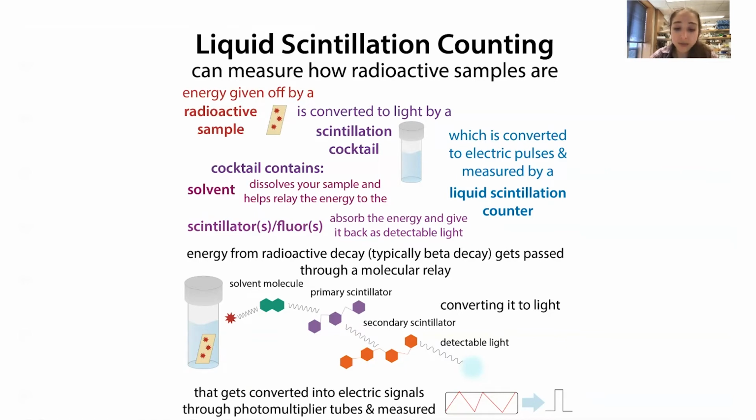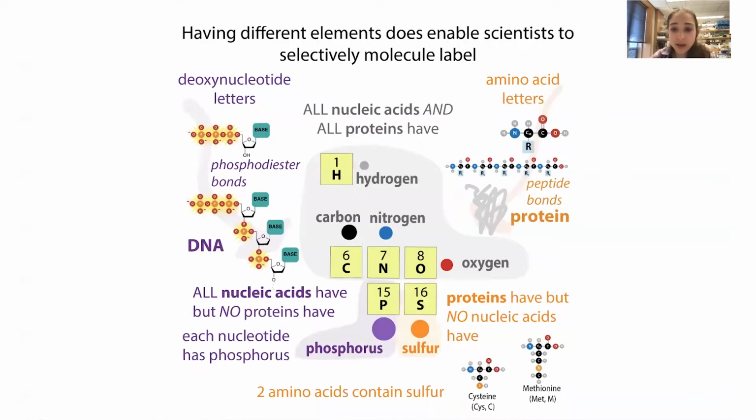And this is really cool because being able to radiolabel molecules is a really great way to track how things are made, how things are degraded, where things are going, because you're changing out atoms without the other molecules around it recognizing that anything's going on.